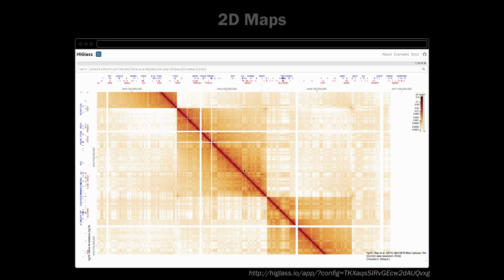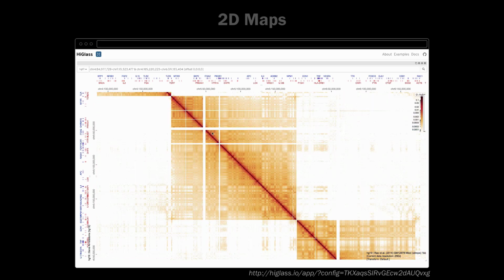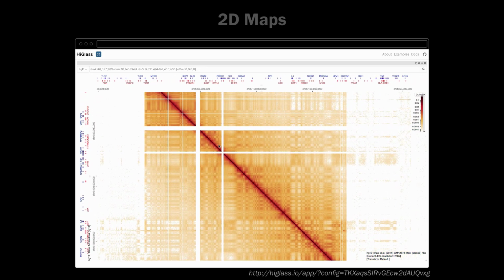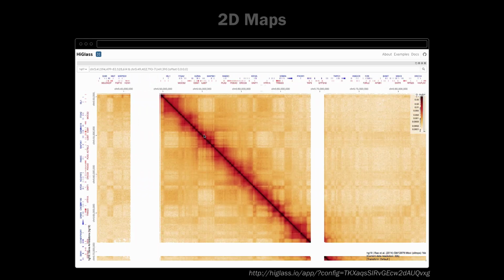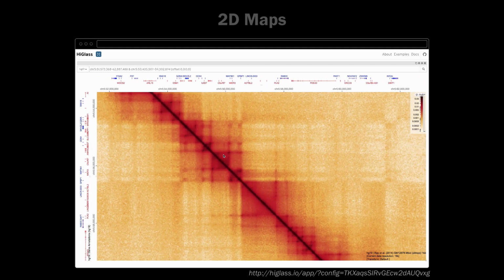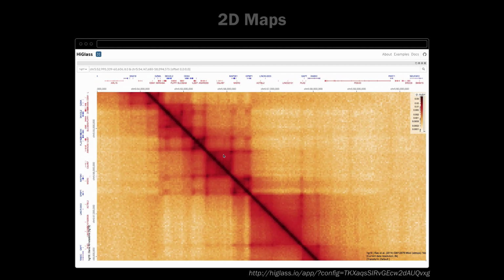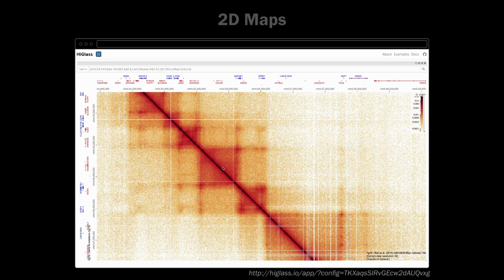You see there's occasionally a remapping of the colors because now we're zooming into a region where the maximum value is different, and if you wouldn't do this, because the dynamic range of these interactions is so large, you would just basically see nothing if you wouldn't update the color mapping. The reason for that is that these interactions are, I don't know by how many orders of magnitude, stronger than everything outside. So now we've zoomed in and we can see a little bit of structure.